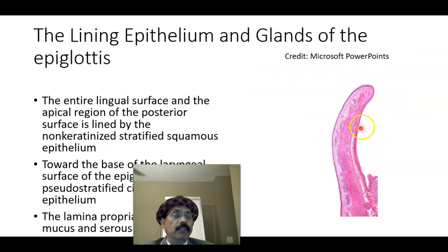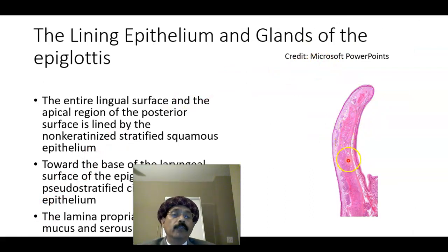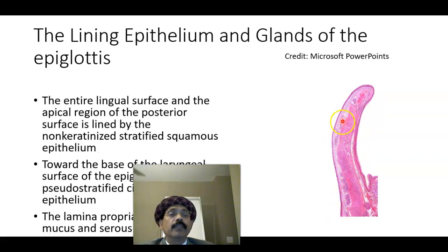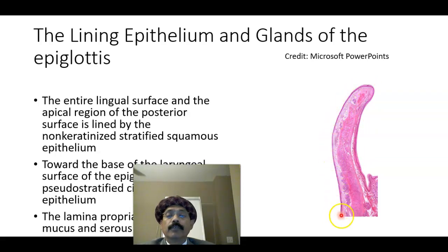This is a picture of the epiglottis from another source. This is the laryngeal surface and this is the lingual surface.